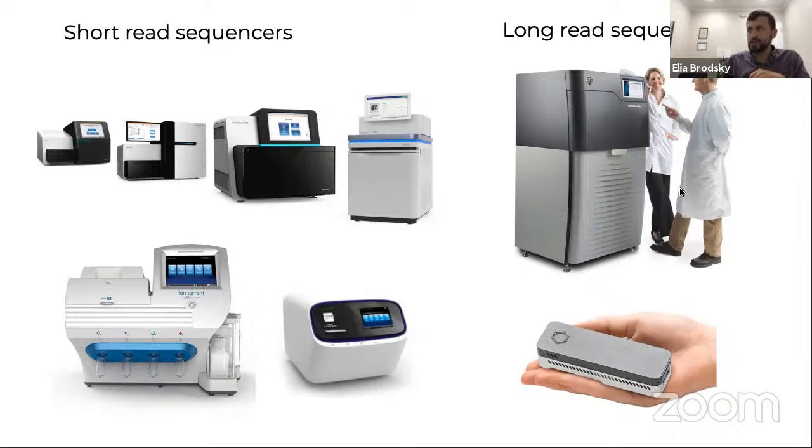So these, for example PacBio, can be as long as tens of thousands of nucleotides. When we talk about short read sequencing, they could be as short as 30 nucleotides long. So very, very different types of data. And the challenges and the type of data that they produce are also very different. So let's talk about that a little bit.